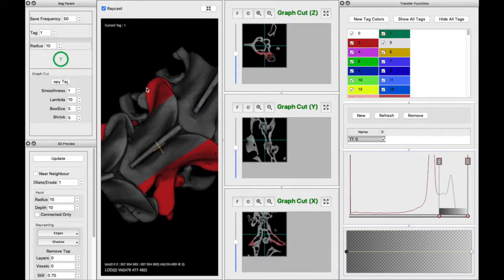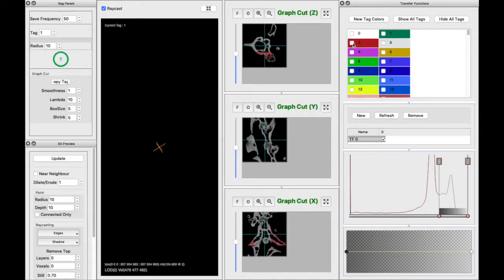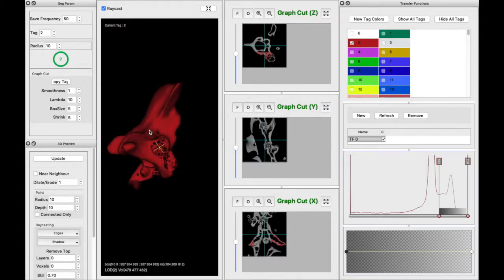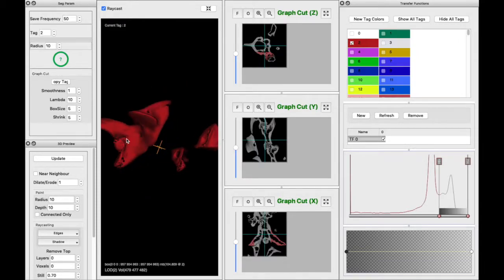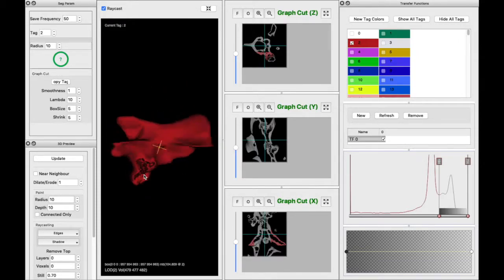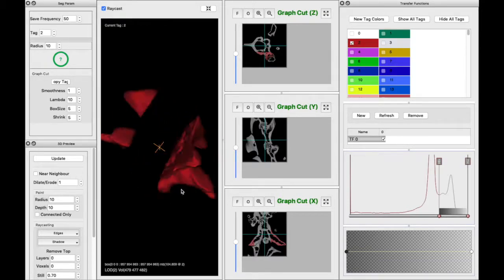Look, you can see that's the stuff that we did yesterday, and it looks like we made some good progress over here, right? That's where all that hairiness was. See, I think maybe in here there's going to be part of a vertebrae, the other vertebrae, or the part of the rib more like, that we need to go in and erase, but yeah. Good progress.